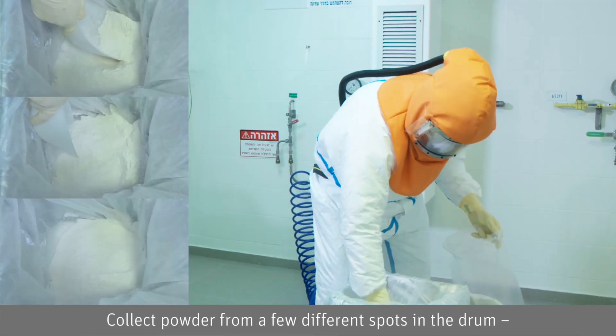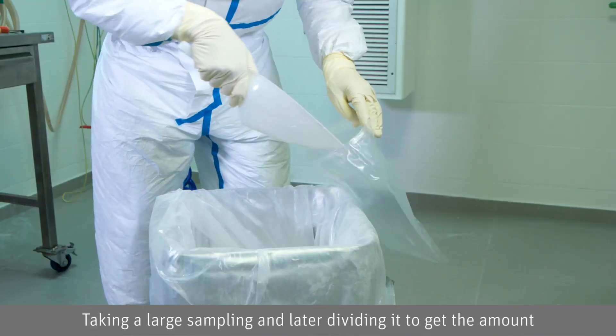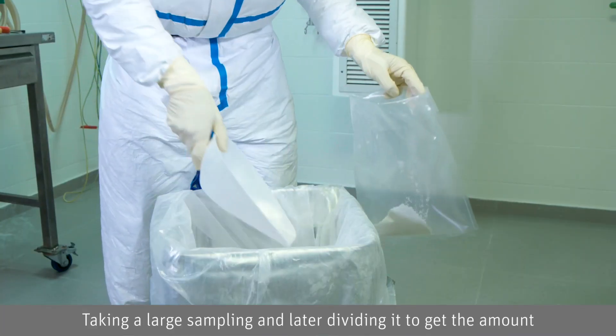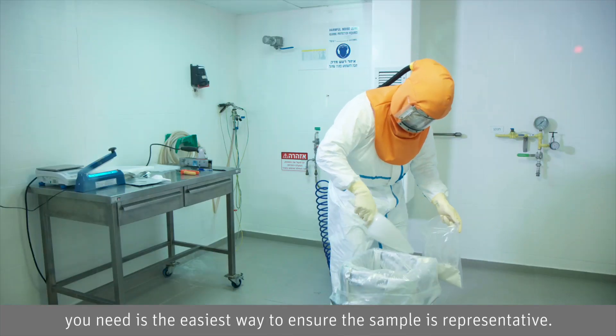Collect powder from a few different spots in the drum — top, middle, and bottom — about 30 grams each. Taking a large sample and later dividing it to get the amount you need is the easiest way to ensure the sample is representative.